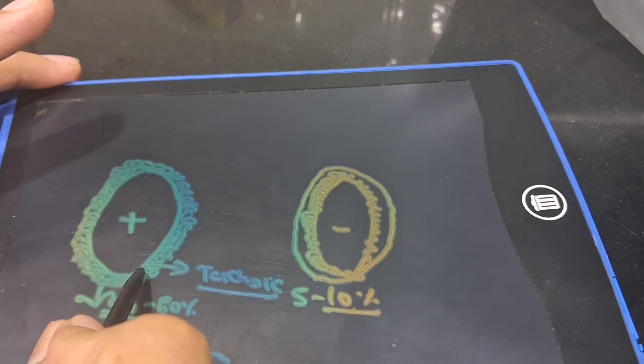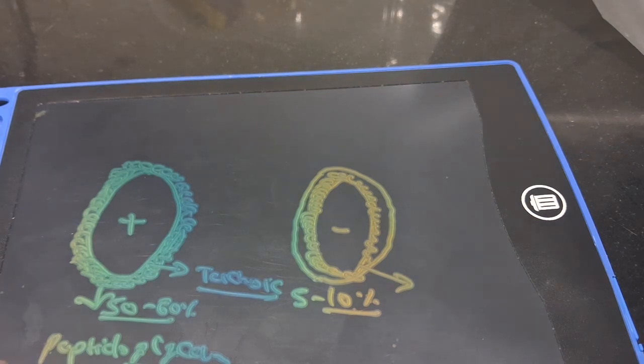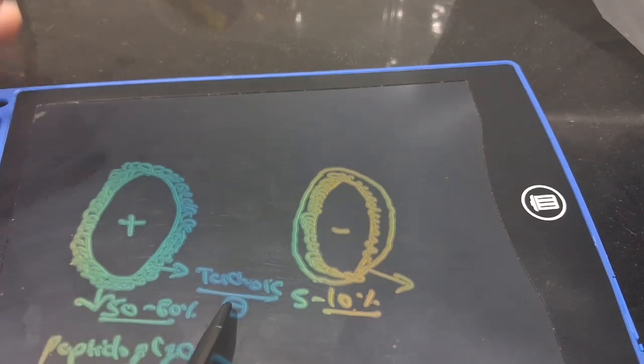It is present in the peptidoglycan layer of both gram-positive and gram-negative bacteria, and it is negatively charged. You need to remember that teichoic acid is negatively charged, and because of this charge the dyes combine with the peptidoglycan layers. This is the main factor that decides whether it will be a gram-positive or gram-negative bacteria.